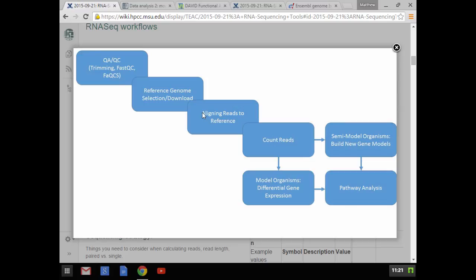If you want to do comparisons of gene expression of a single sample, so if you're just doing differential gene expression between multiple samples, that has absolutely zero value. If you're interested, however, in comparing gene A and gene C within the same sample, RPKM becomes much more valuable because now you can actually do a straight one-to-one comparison.